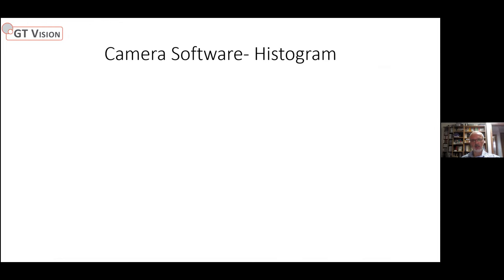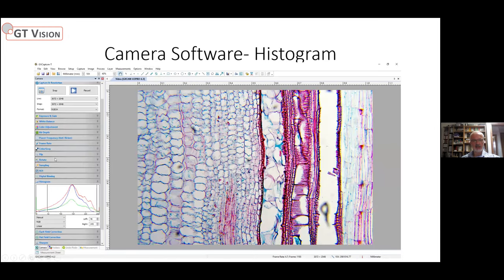Having got the image, you can optimize it further. You can use the RGB histogram to add contrast and make the image punchier. There are also color adjustments — brightness, contrast, and gamma. So once the image is displayed on screen, there are a number of ways to make it look really nice and precise.